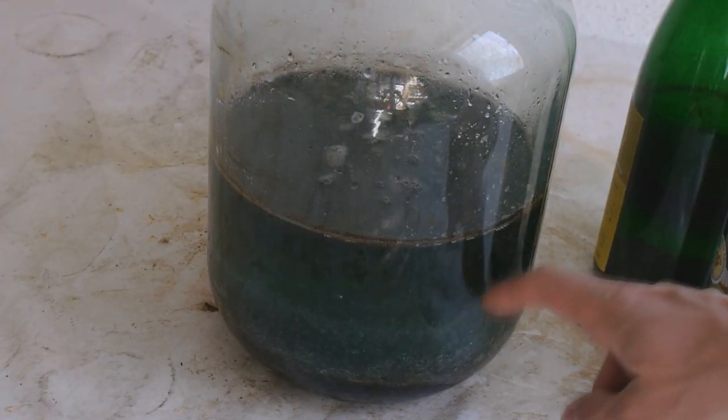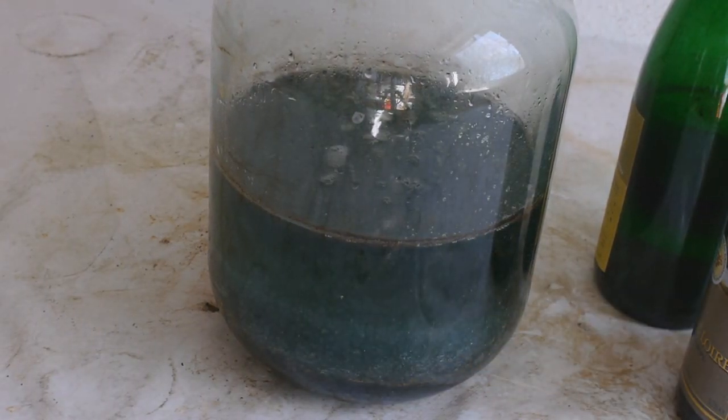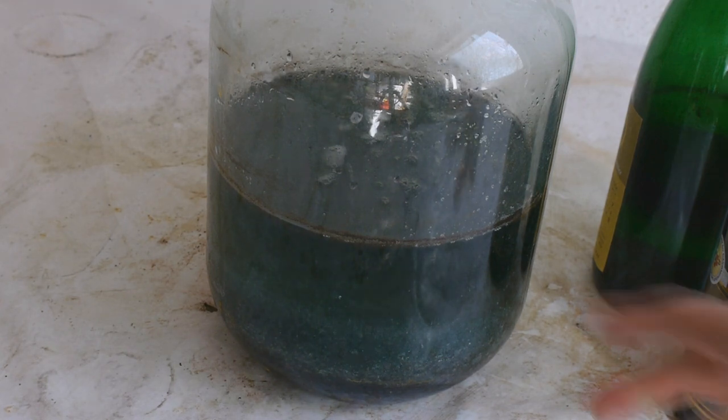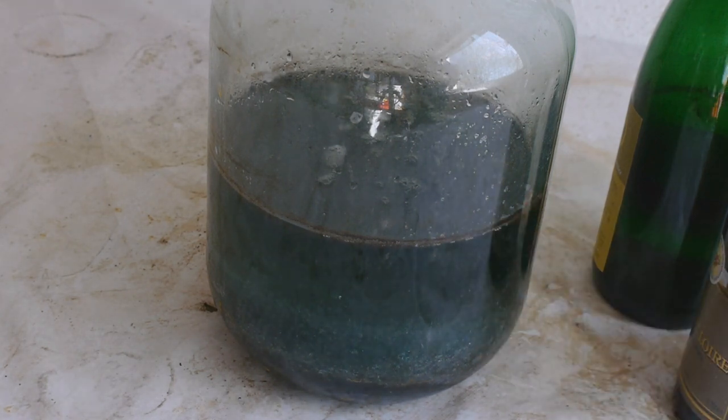As you can see, however, the iron sulfate is still quite impure, and that's because of the coal that's contained in the steel wool. So the first thing that we have to do is a hot filtration to remove all those insoluble impurities.